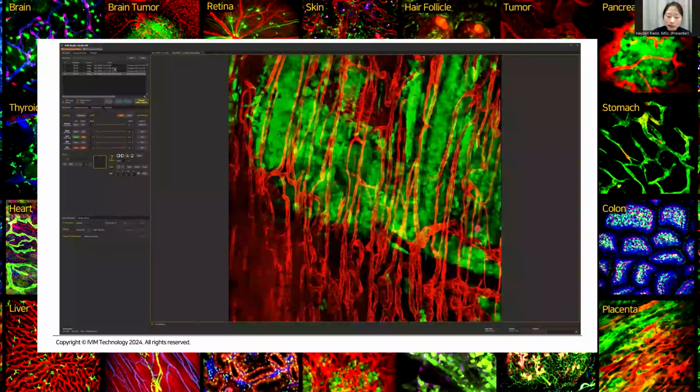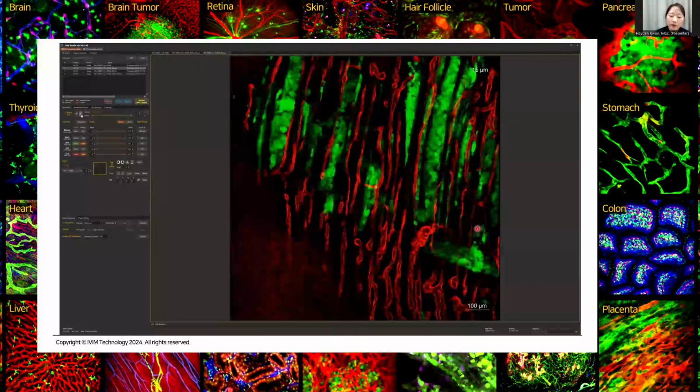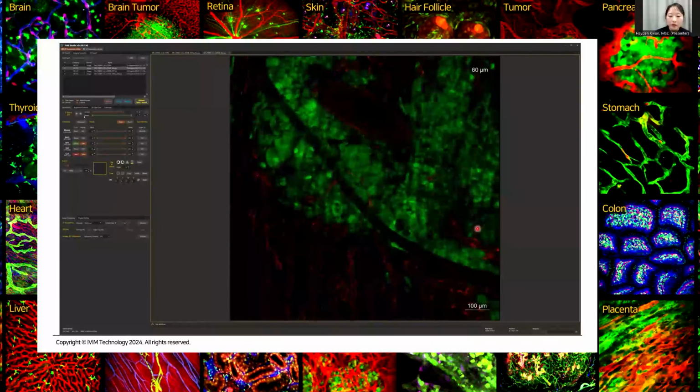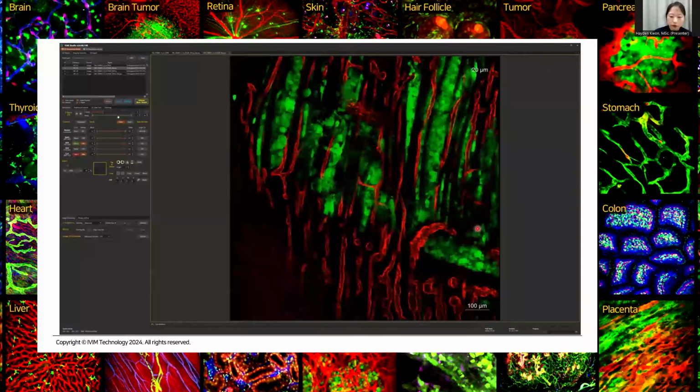Without the Z projection function, all the images are located at their individual focal planes. So we can see the depth information images from the surface to the bottom in the wide area region of interest.